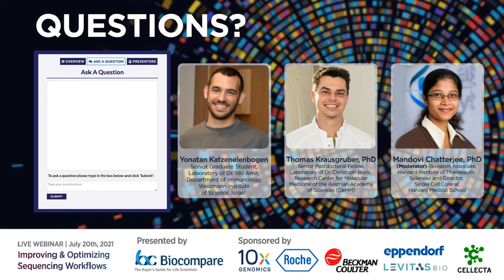So the last step of library prep, when you add the sequencing adapters, is almost the easiest part, and there are many commercial kits around that you can use. Once you're done with library prep, at least what I do is a quality control on each sample, running a bioanalyzer profile or a tape station profile, because you really want to sequence good quality samples.